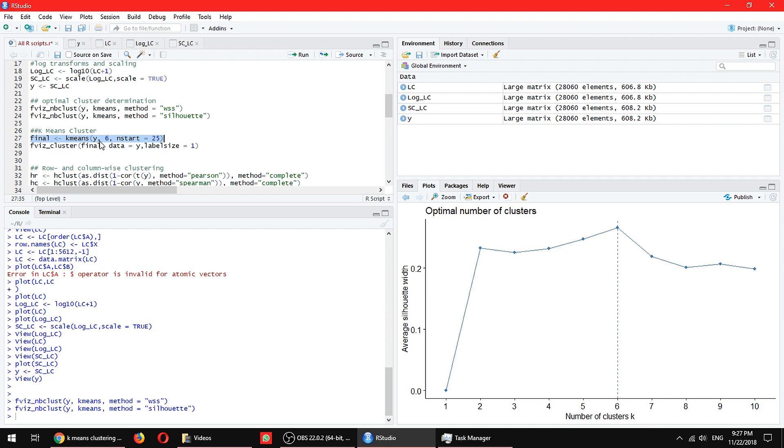In this case, Y is the dataset that we have assigned earlier. 6 is the cluster that we determined to be the best. N-start is actually how many initiation points you want to start with. You can also study that in the documentation in R and the R package and all that thing. In this case, this nstart 25 is the default value. I'm not going to change that because I'm actually not going to use this graph anyway.